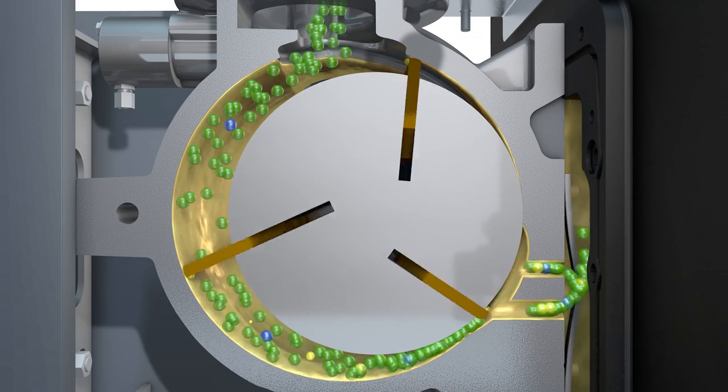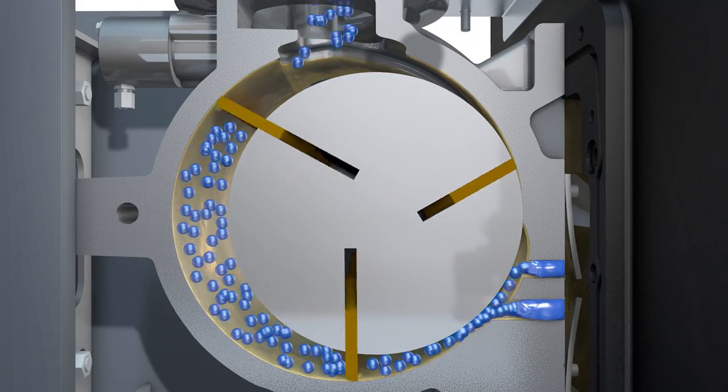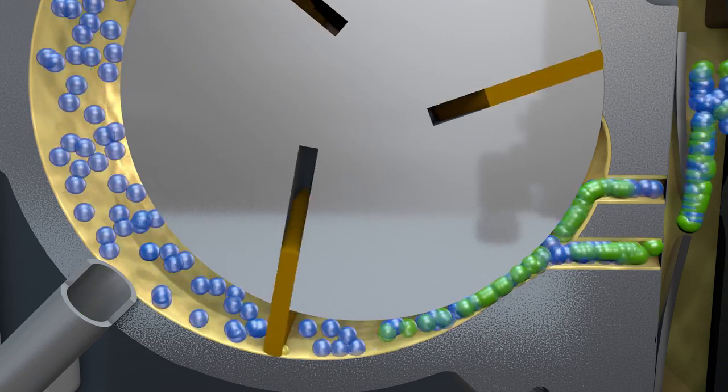As the volume is decreasing, the gas gets compressed and exits to the oil casing. Adding a gas ballast prevents condensation by diluting the pumped vapors and increasing the pump temperature.